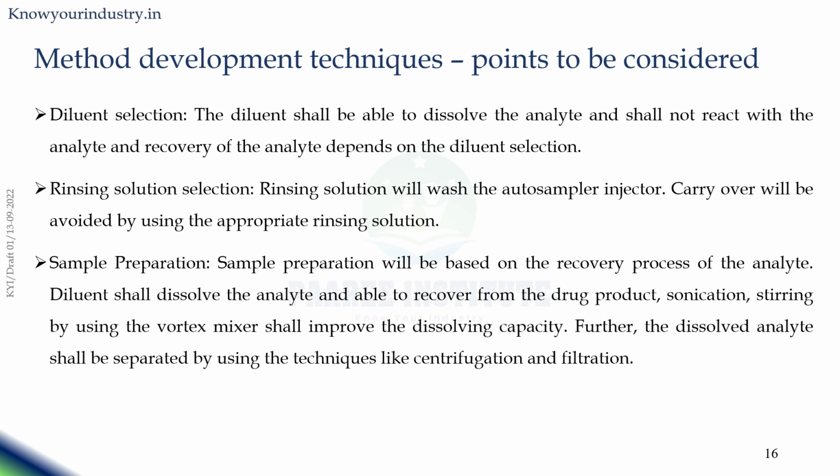First and foremost is the diluent selection. The diluent is what you use to prepare the standards of the analyte, and the diluent should dissolve the analyte and it should not react with the analyte. This is the most important characteristic required for a diluent, and recovery of the analyte is based on your diluent selection.